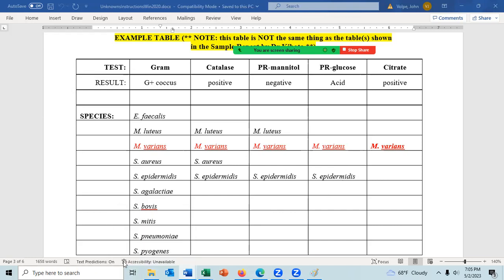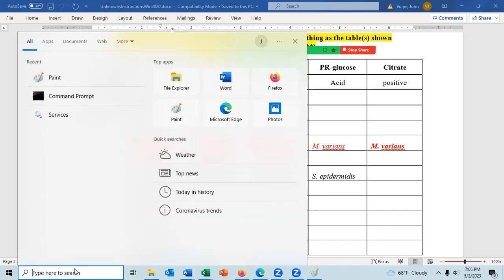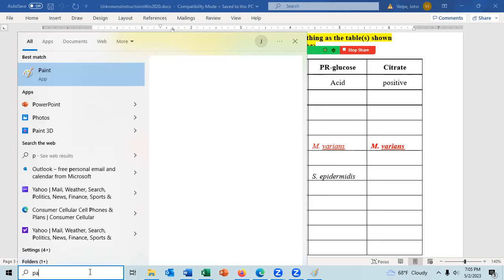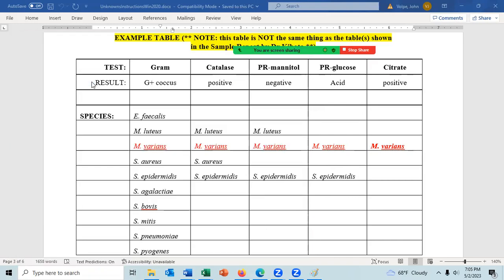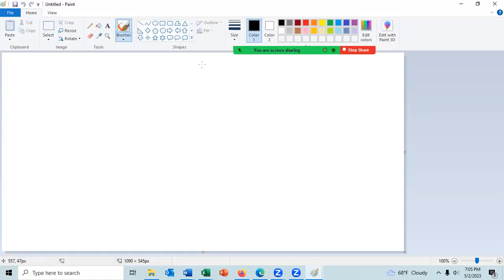And the figure can be like a hand drawing. Remember I showed you kind of Paint earlier? I think I've already closed it, but I said what's common is people do the gram stain. So we have all. I'm going to just do this very simple here. And then we have the gram positives. And we're going to go gram here.